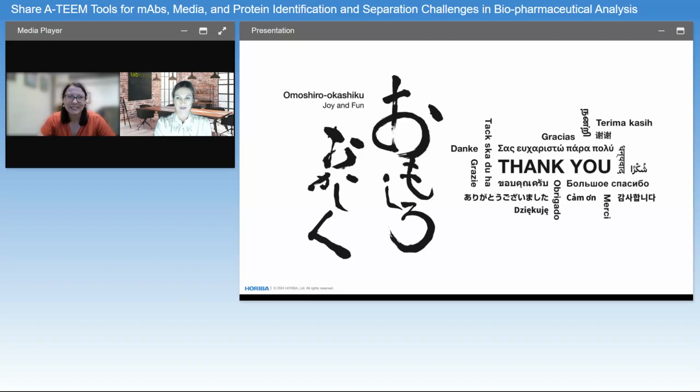Very good. Thank you. Now, you were touching on this while this attendee was writing this, but they're asking if you could comment on if someone would want to use A-TEEM to characterize an in vitro bioassay exposure. Does A-TEEM have sensitivity to differentiate C-free versus C-bound, where bound could be bound to proteins in the serum or bound within cells of the assay?